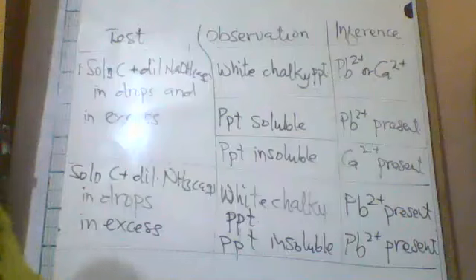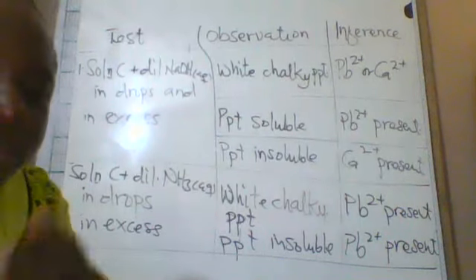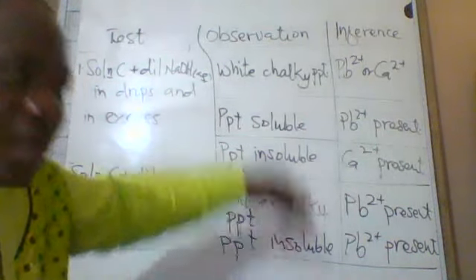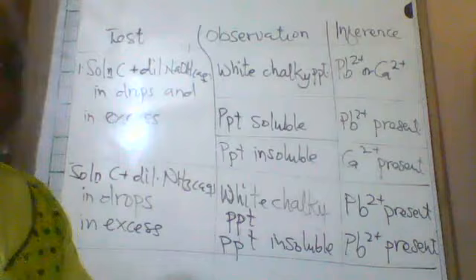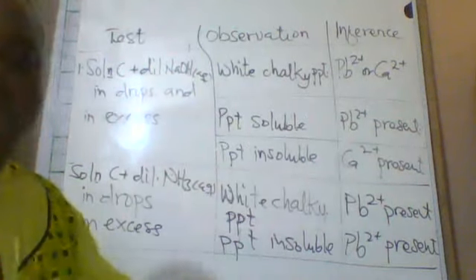Oh no, in fact, the confirmatory test comes after the preliminary test.